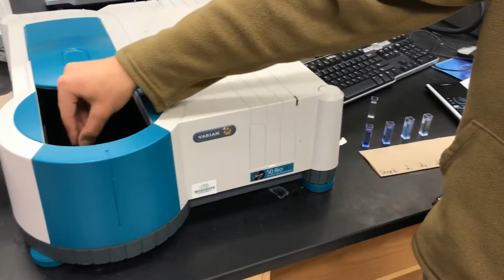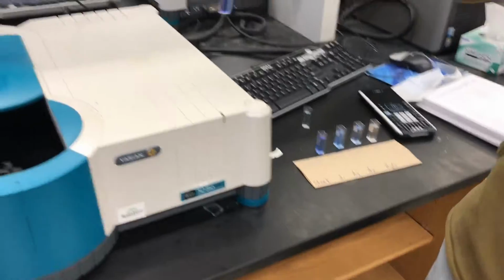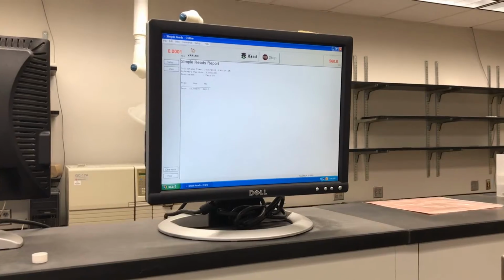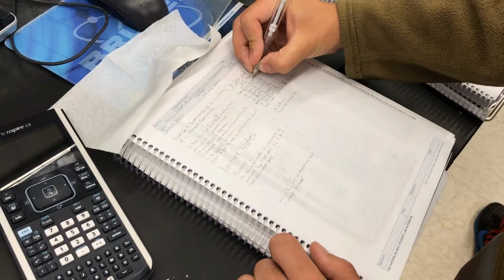Based on Beer's law, absorbance and concentration are directly related, meaning they have a linear relationship. Failing to zero the spectrophotometer with a blank will make the absorbance appear higher than it really is. When you zero out, you are setting whatever absorbance the blank has due to impurities to zero, so that absorbance won't be counted in the actual solutions.